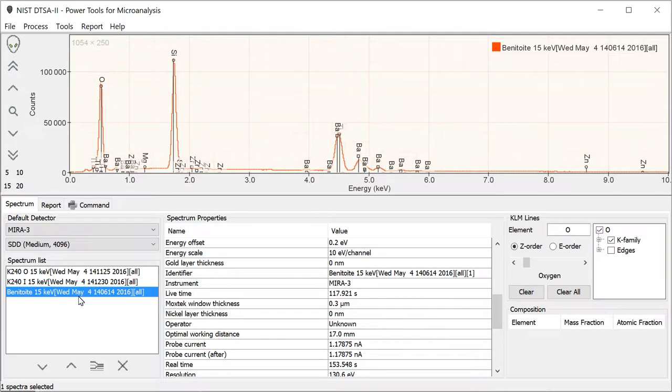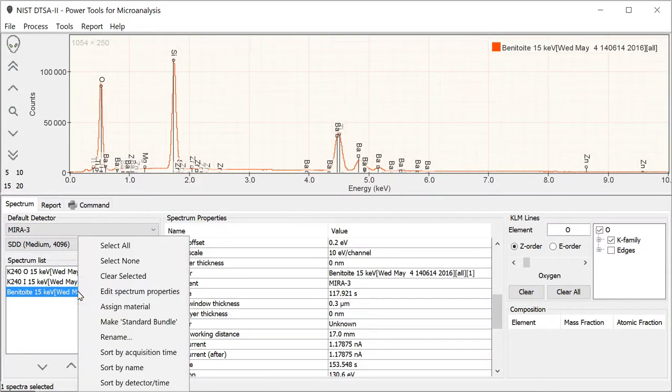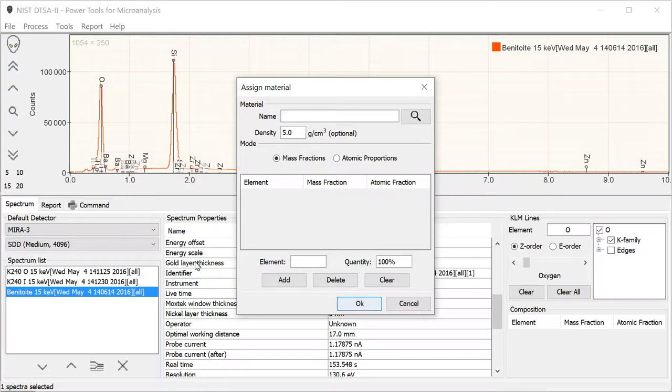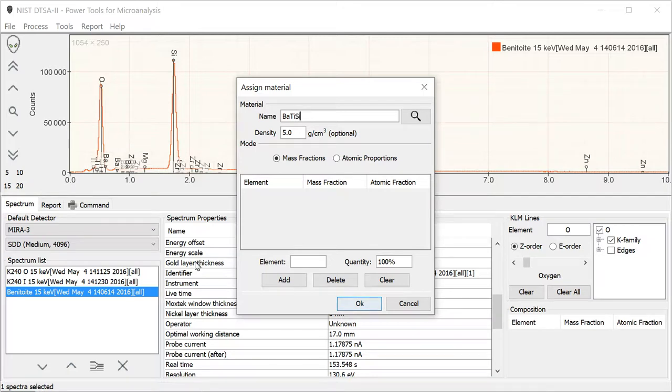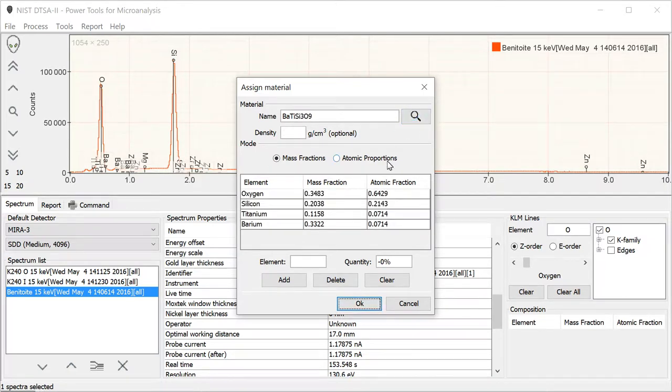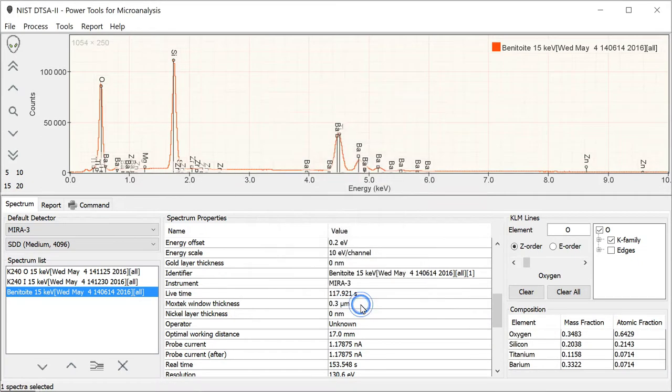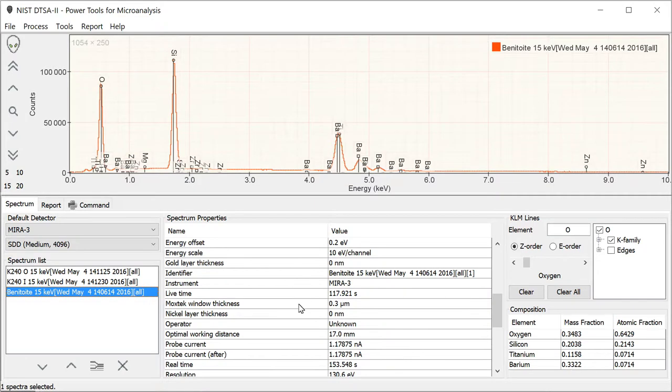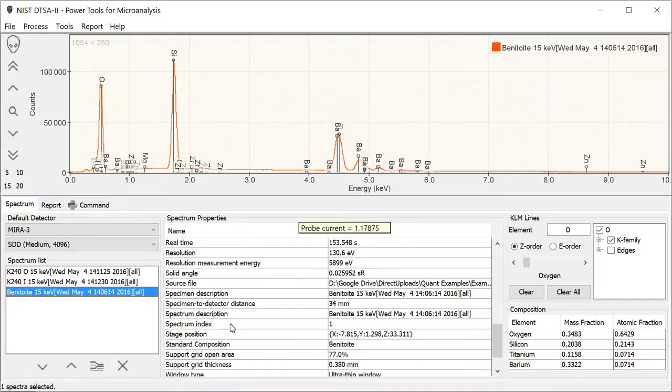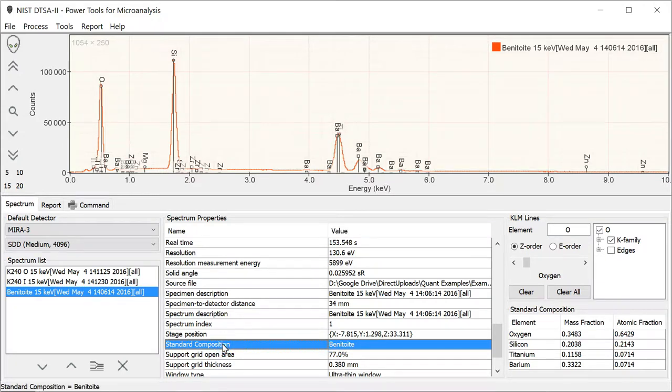You can also specify what material this spectrum came from. You can do that by right-clicking and selecting Assign Material, in which case we can specify that it came from Benitoite, which is barium-titanium-Si3O9. Either way, it doesn't really matter. If it's in the database, it'll give you the same results, essentially. When you select that particular spectrum, you see that the composition is displayed down here. There are two different types of compositions that can be associated with a spectrum: a measured composition and a standard composition. What we just assigned was the standard composition.